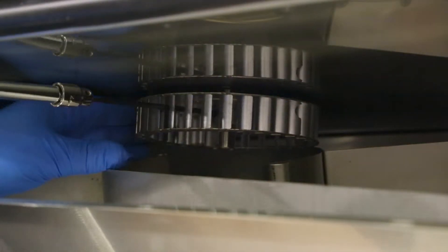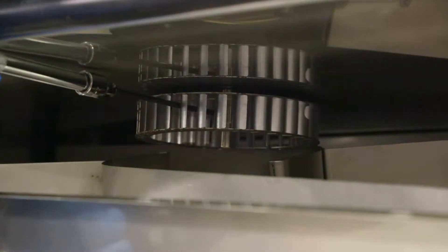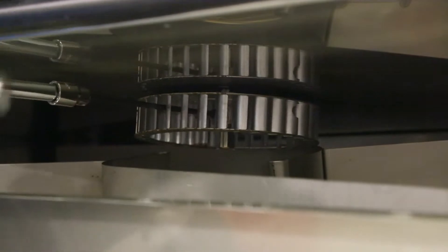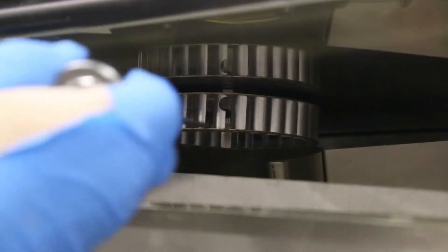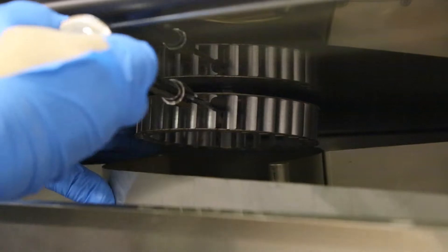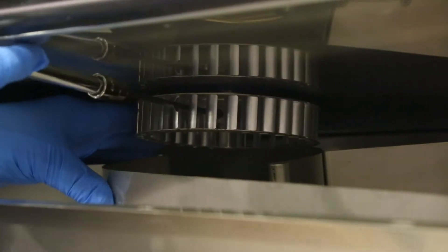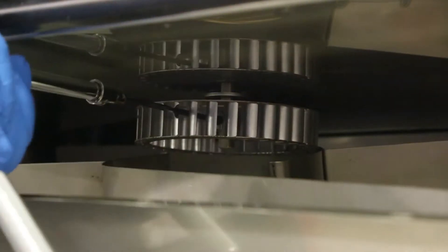There are two set screws on the fan wheel that need to be loosened with a five inch long M4 Allen wrench. Once loose, you can slide the fan wheel off the shaft.